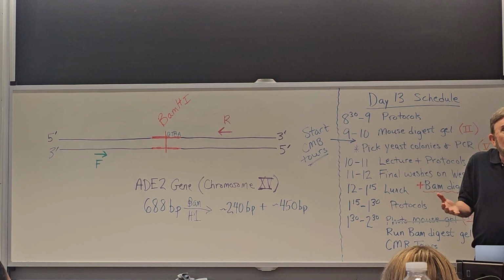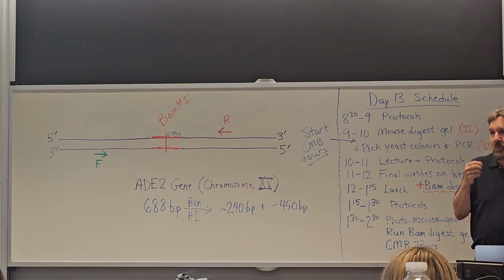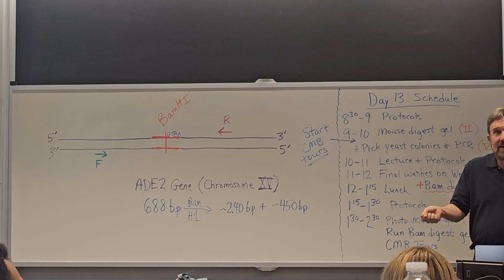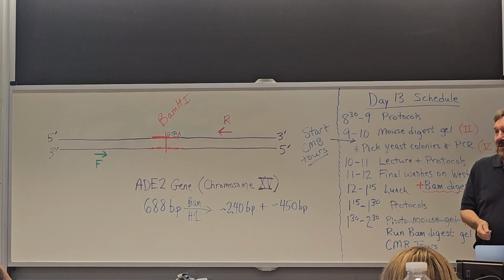And so how would we know if we got CRISPR? Well, what we do is take our colonies, and we would have to pick colonies at random and do PCR, and that's essentially what you just did downstairs, right? You pick some colonies at random, colony PCR. So that's how you have to do it.